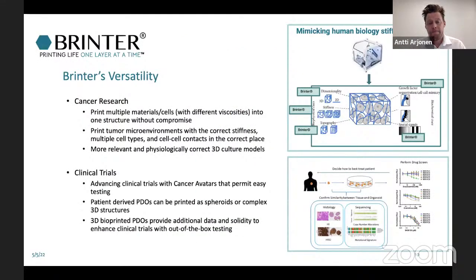And taking these cancer models on a broader scale, with 3D printing and with the printer, we can sum up the dimensionality, stiffness, topography, different kinds of growth factors, after different kinds of interventions, drugs for example, and different kinds of spatial signals.